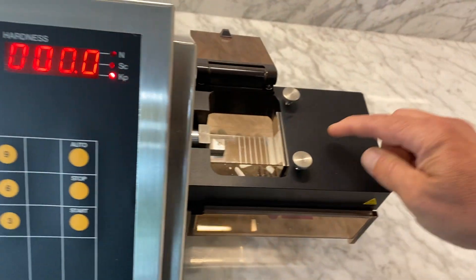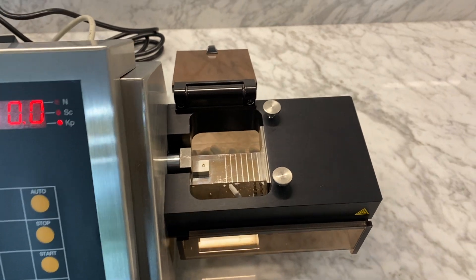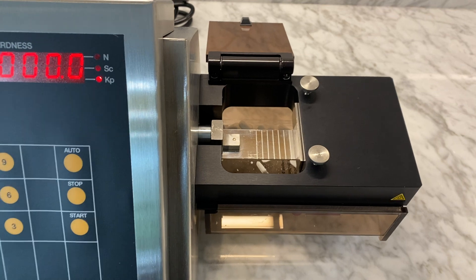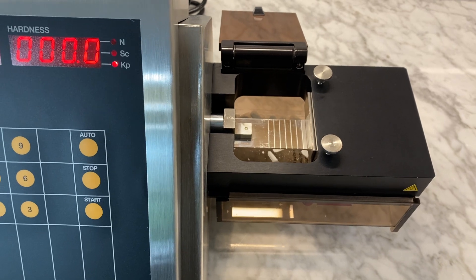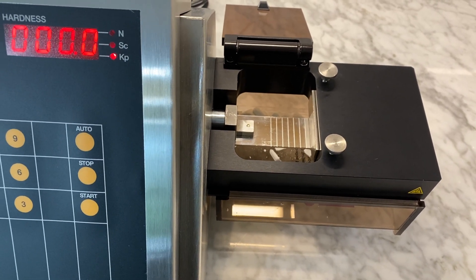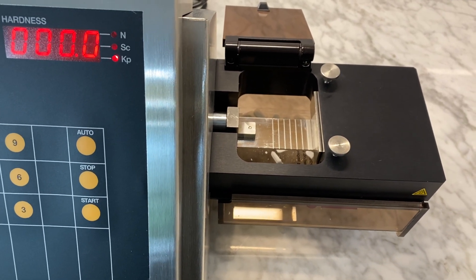The load cell comes in a 300 Newton, which is good from 0.5 kp to 30 kp — suitable for micro tablets and smaller, softer tablets. A 500 Newton load cell, which is the most common, ranges from 5 to 50 kp. And an 800 Newton load cell, which goes up to 80 kp, is useful for testing hard dietary supplements and tamper-resistant formulations.